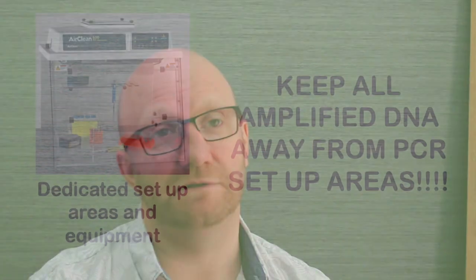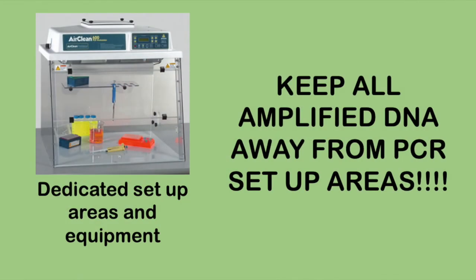Biggest problem is usually contamination along the way. And I never mentioned this as we went through. If you put your own DNA into the sample, by having a dust mite or whatever, then you're going to get a product that's not going to be related to our experimental question. So you have to be very careful with all the pipette steps. And that carefulness is really exacerbated by the fact that we're using very small volumes throughout.